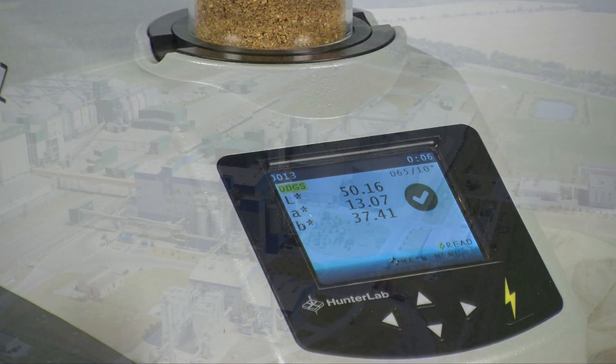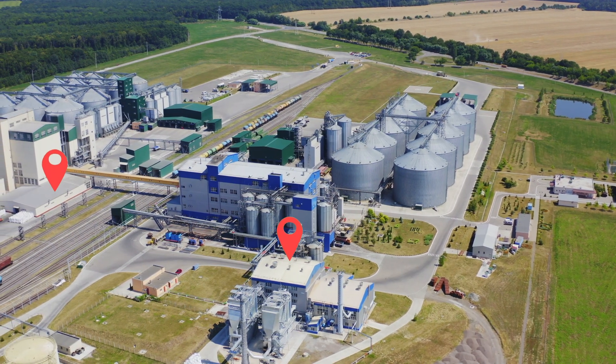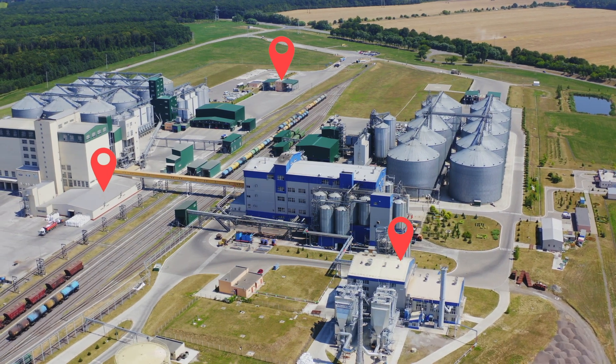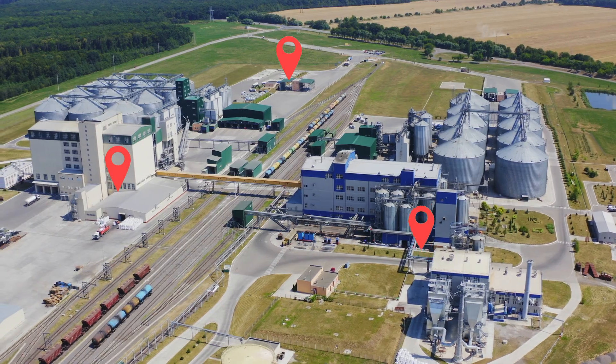With its compact and rugged construction, the ColorFlex EZ can be placed anywhere in your facility. And if your facility is expansive, its pricing allows for placement of multiple units within your facility, saving you immeasurable time and steps to evaluate a sample.